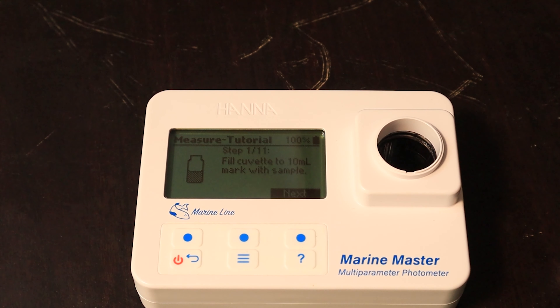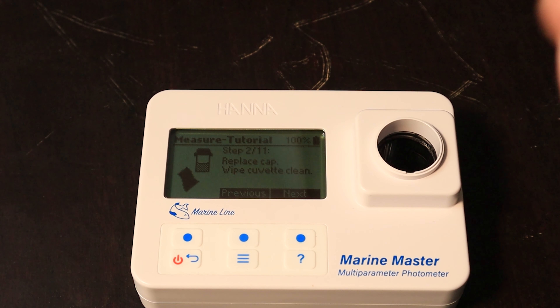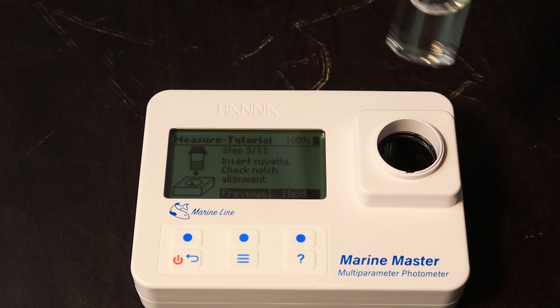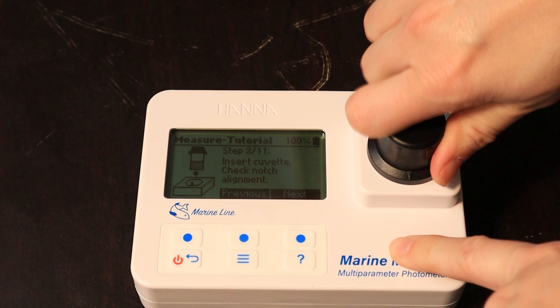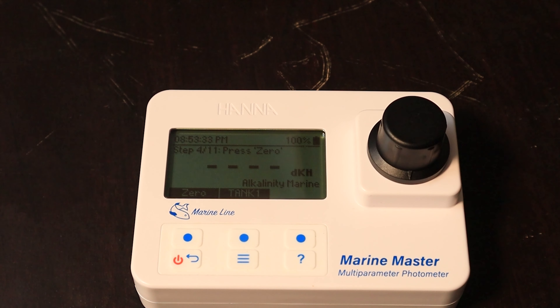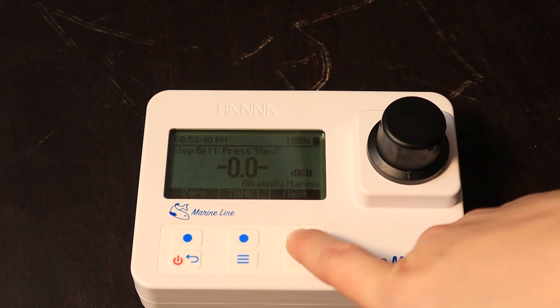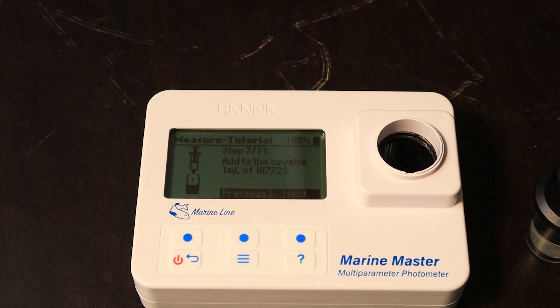Okay, step one had me fill it with water, hit next. Step two: replace cap — did that. Wipe it clean — it gives you a cloth to wipe off all the fingerprints. Insert your cuvette, check the notch alignment — there's the notch alignment right there. Hit next and press zero — zeroed it out. Hit next, remove it, hit next, and then it says add one milliliter of the reagent.